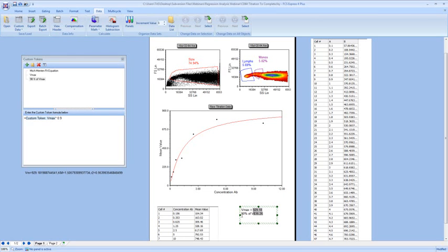Since I entered the custom token, the Vmax times 0.9, here's our 90% value, and we can say 90% of Vmax equals 836. And again, I just want to draw attention that when I update these gates, these values are updating in real time as well. So we're calculating all of this on the fly. Now that we have this 90% of Vmax, we can just back calculate doing a y to x conversion to get the amount of antibody needed at 90% Vmax.